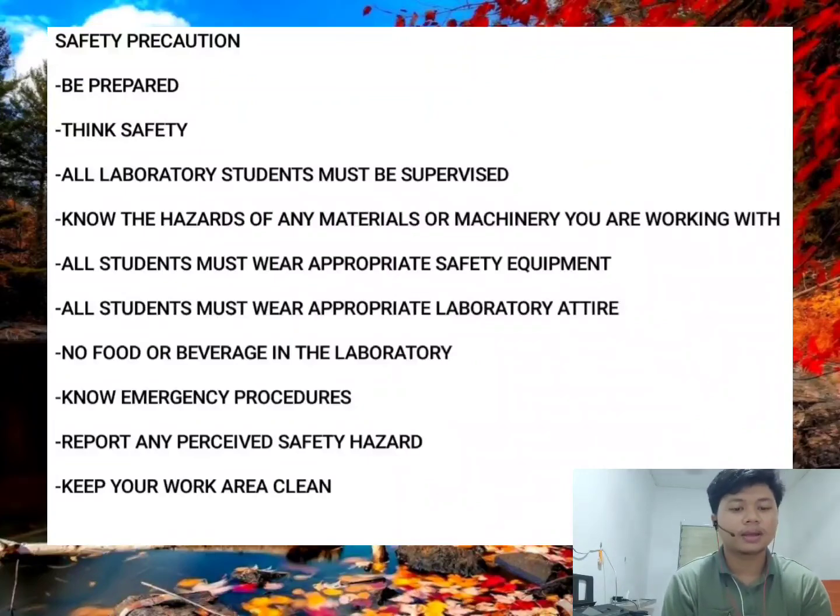Next, report any perceived safety hazard. Immediately report any spill, equipment malfunction, injury or other perceived safety hazard to your instructor. And the last one, keep your work area clean.